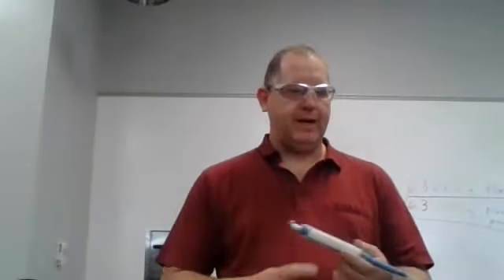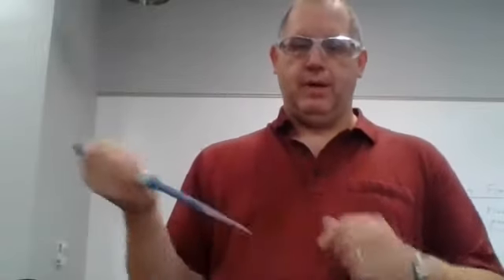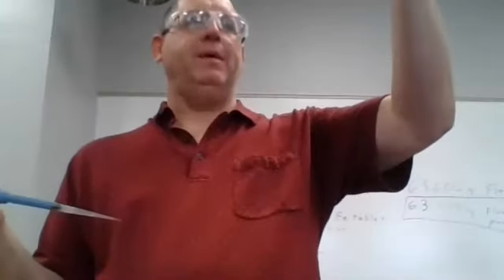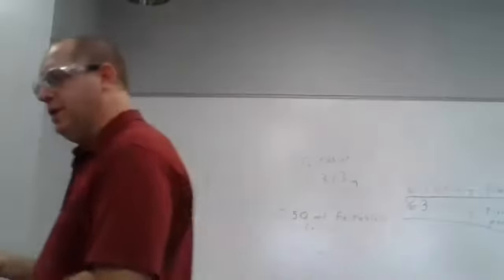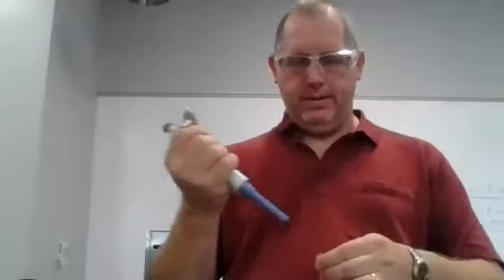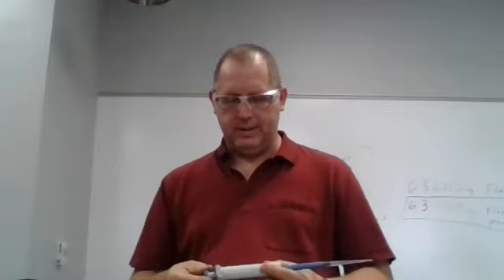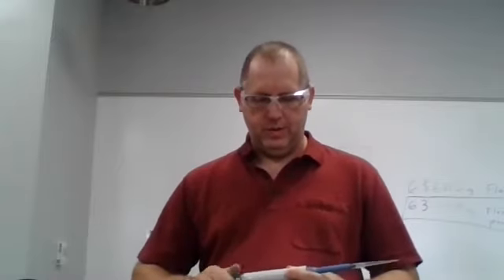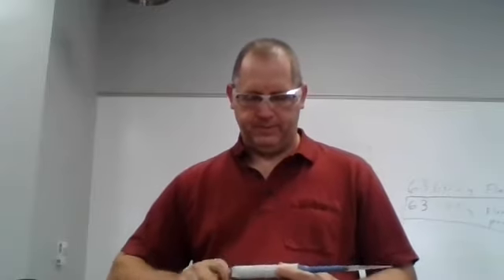Okay, we are back. I went ahead and parafilmed and mixed up these solutions, but we're going to go over to the AA in a couple minutes. Right now, this is a well-mixed iron tablet solution. I'm going to take 1 milliliter of it. Oops, probably should use a clean tip for that. Just so happen to have a clean tip handy. I might have planned for this. Helps if I reset this. So I'm going to reset this down to 0.5 milliliters.